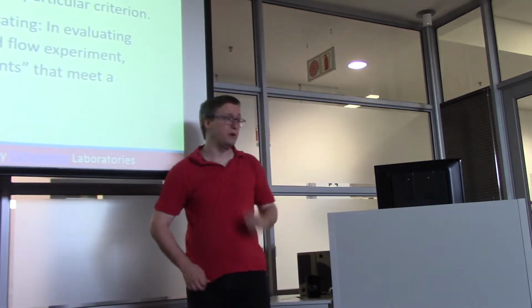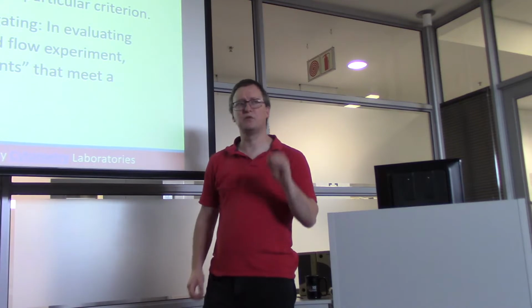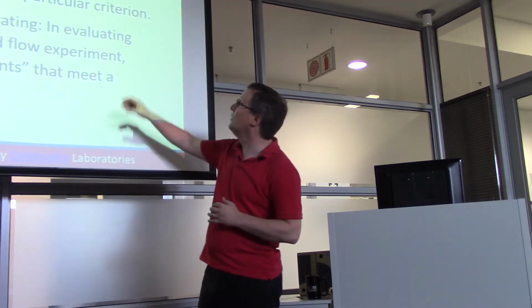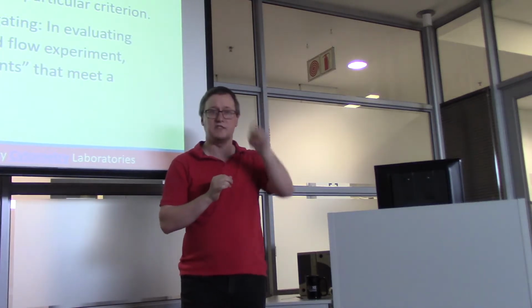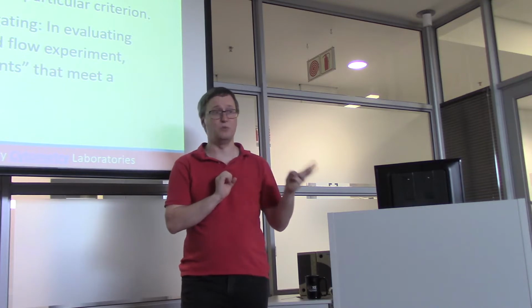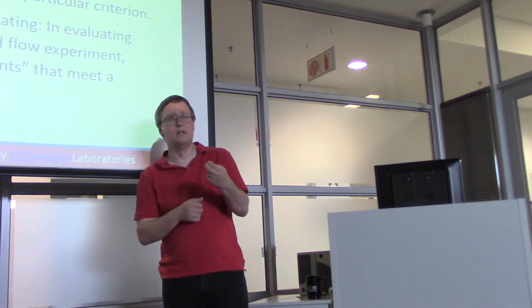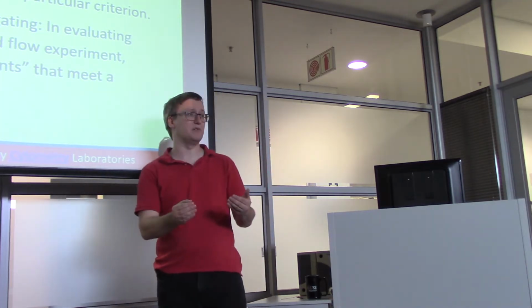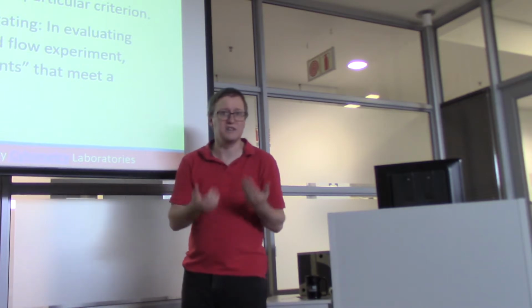Okay, so gating is one of the most frequently used bioinformatic tricks in flow cytometry. But I'm going to try to make a distinction between real-time and after-the-fact a posteriori software gating. So in real-time or live gating, we're only going to record to disk certain events, the ones that meet our criteria. So imagine that you're trying to characterize each droplet that's passing through the flow cytometer. Some of them have 0 cells. Some of them have 1 cell. Some of them have 2 cells or more. We don't really want to store information about droplets that contain multiple cells because we have no guarantee that they're the same kind. We don't want to store information about the droplets that have no cells because they've got nothing to tell us about our biological story. So having a real-time or live gating procedure that rejects information from any droplet that has more than one cell or less than one cell is a very appropriate thing.